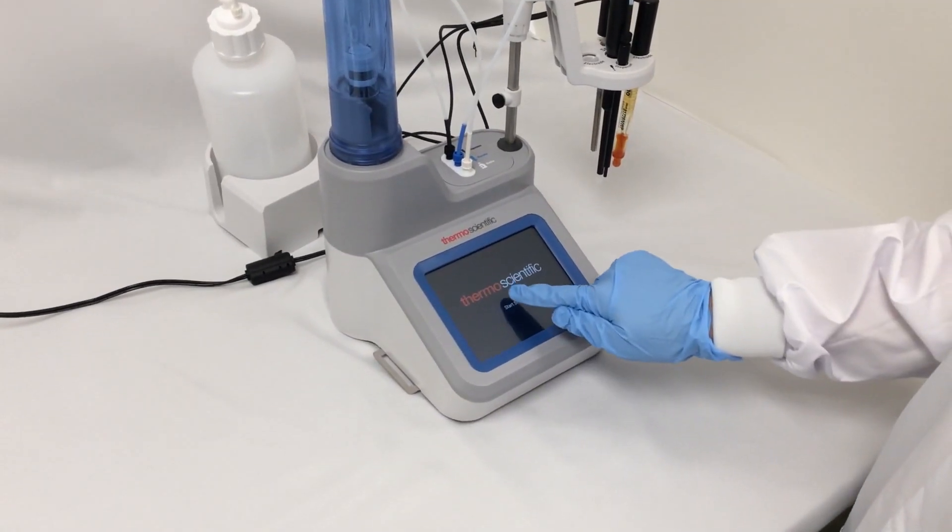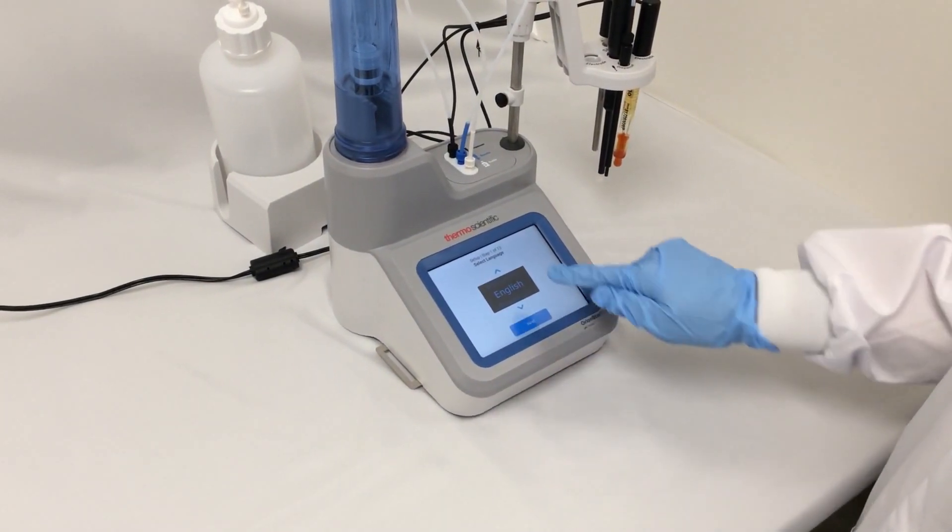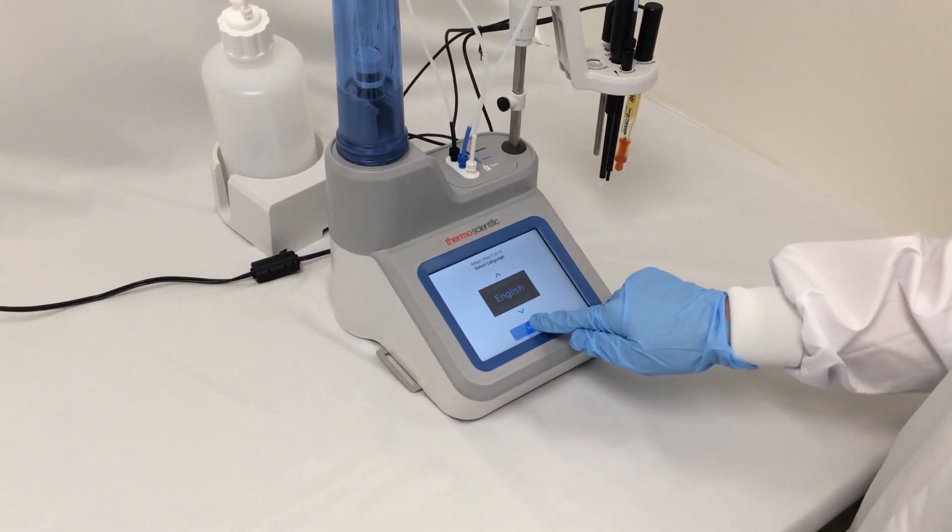My titrator has started. I'm going to press the start setup and choose English as my language.